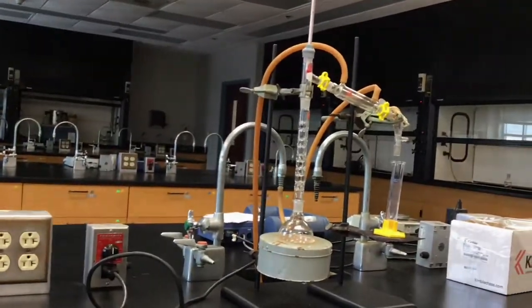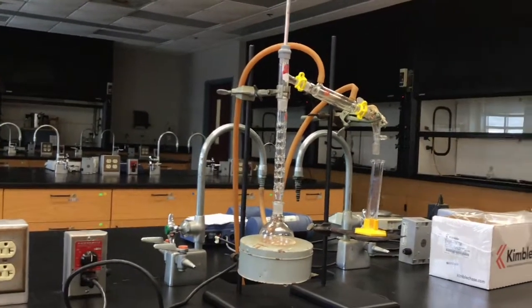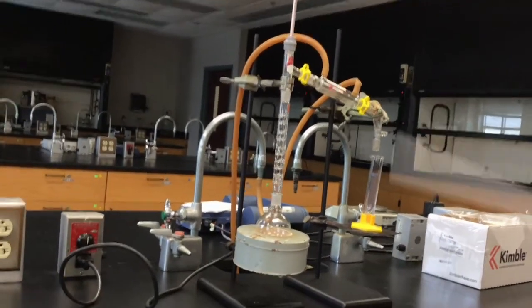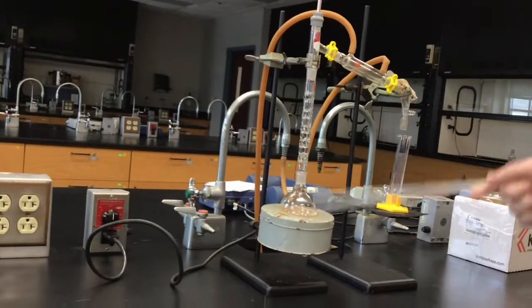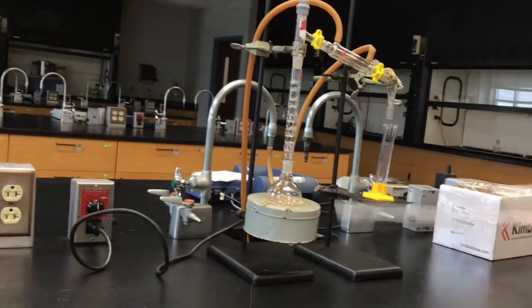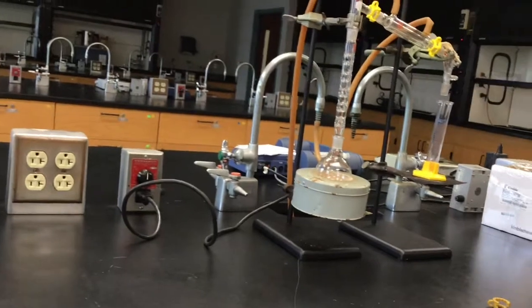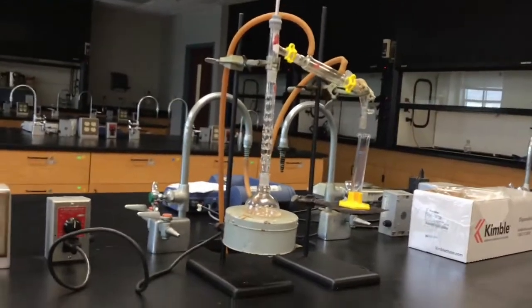So again, the only difference between simple and fractional is the loss of the fractionating column, which in this case, if we wanted to turn this from a fraction to a simple, I would drop the pot and drop the mantle and I'd take the piece off and shove it all back together and it'd be about right here would be the entirety of the distillation.